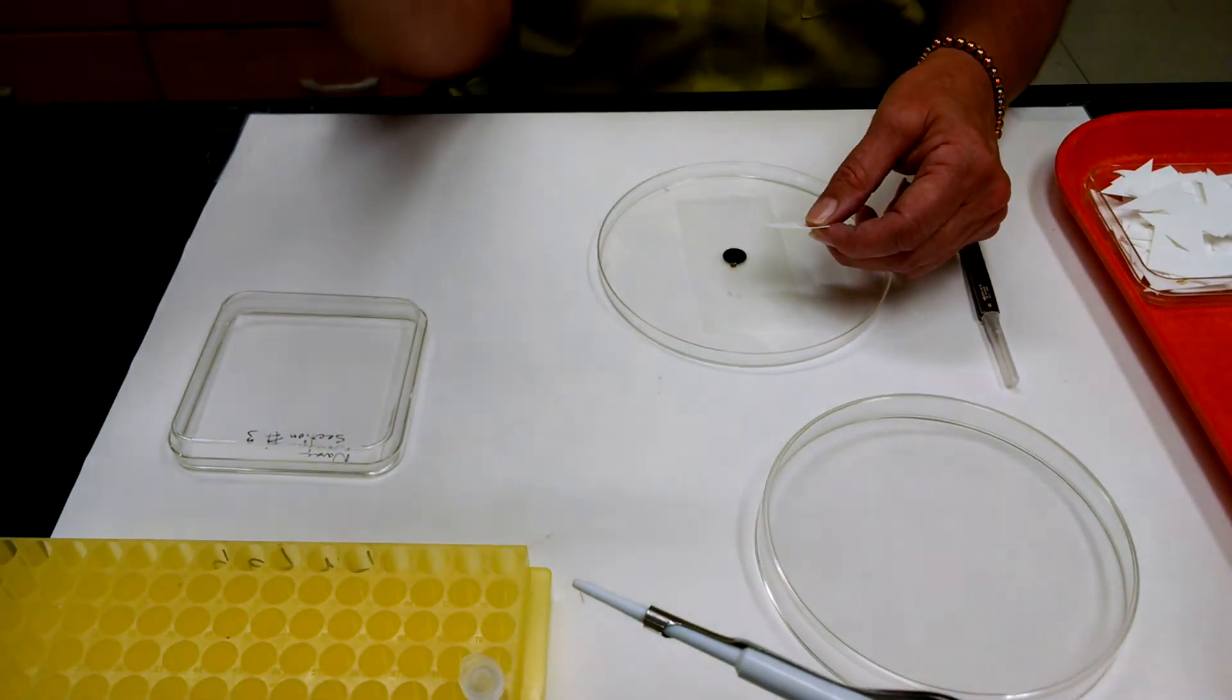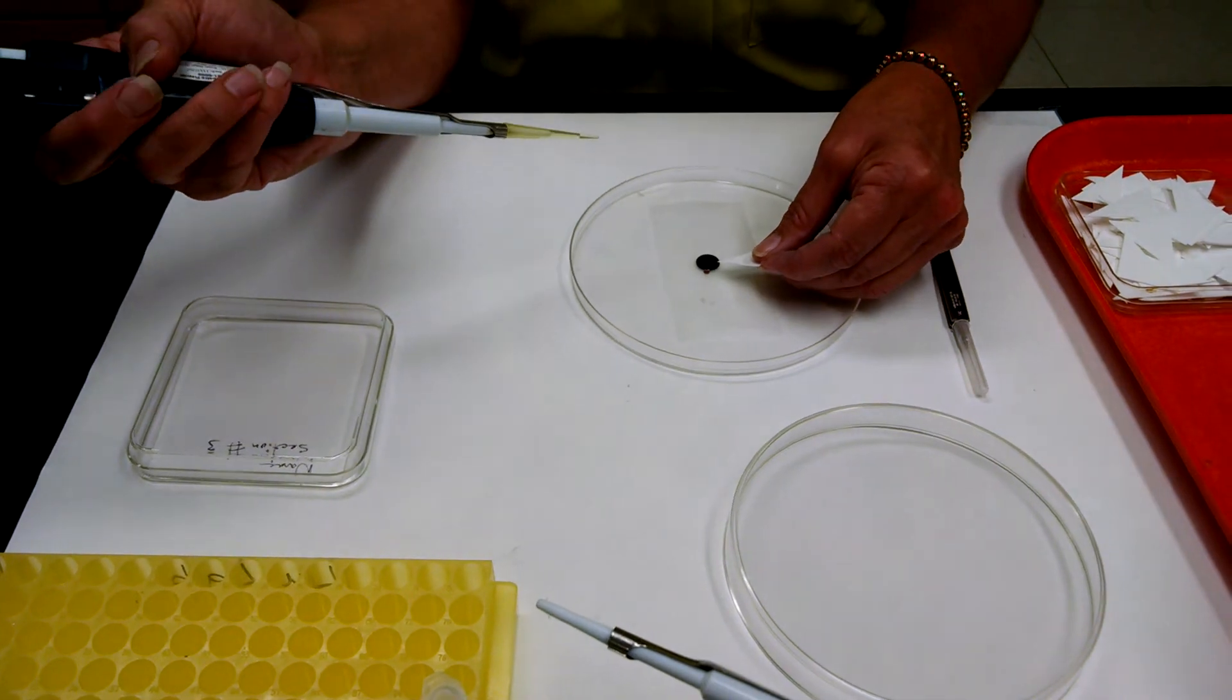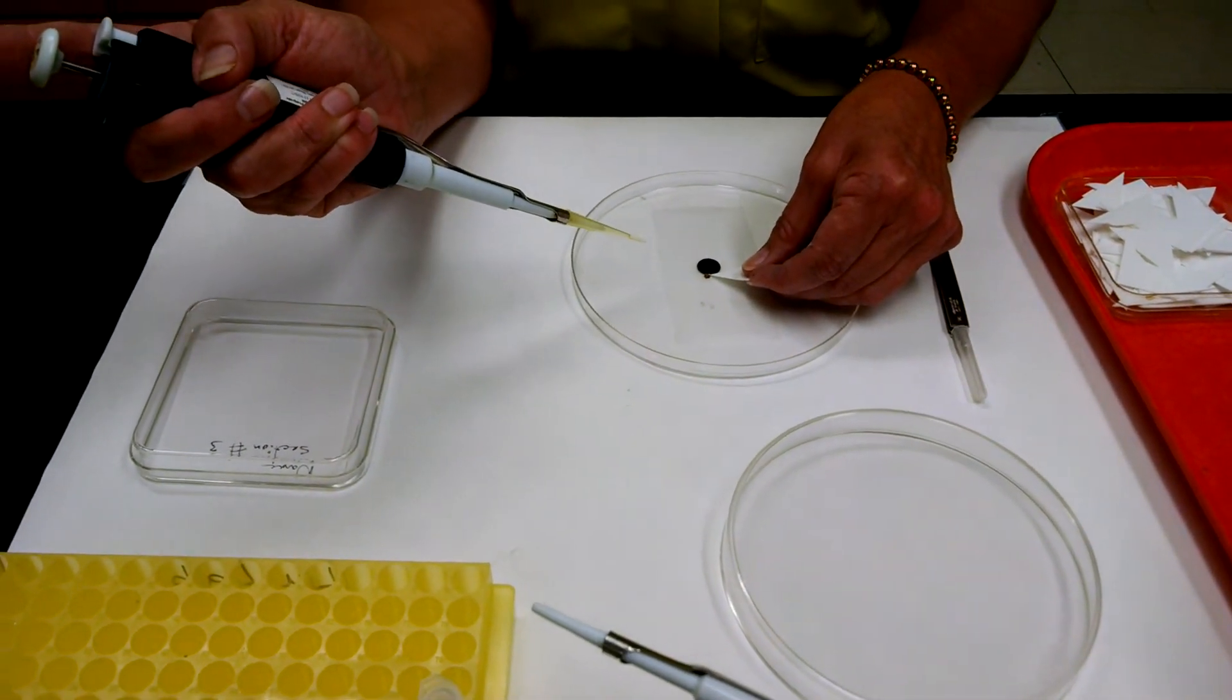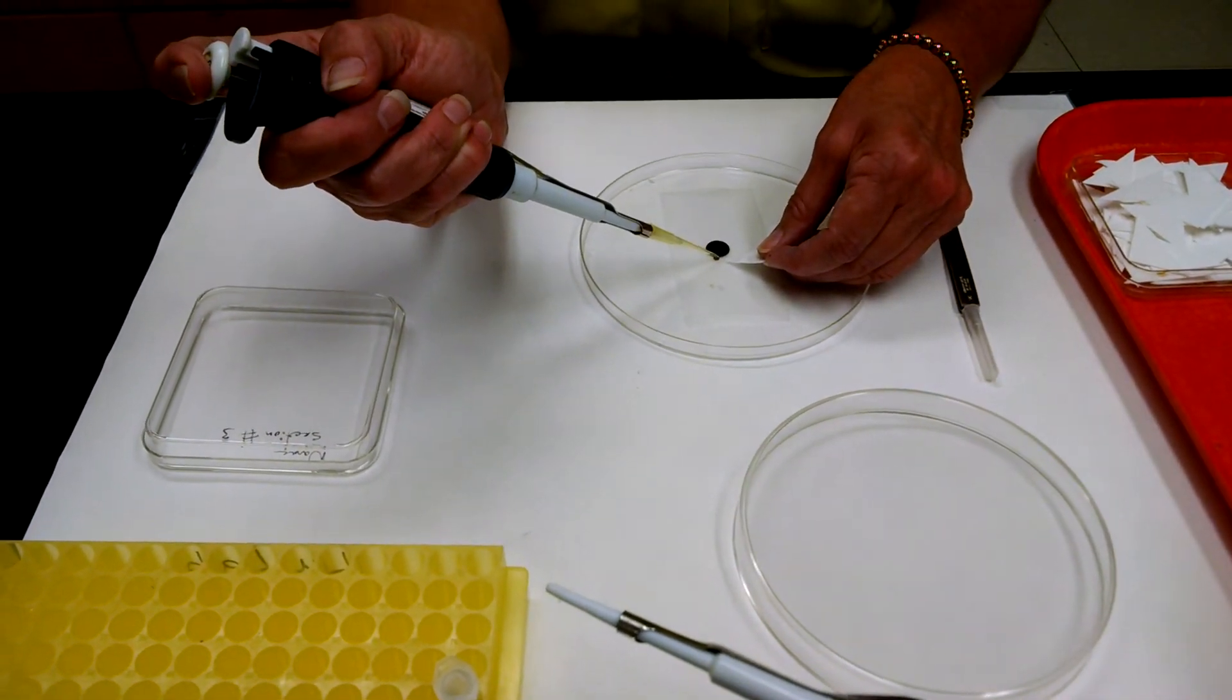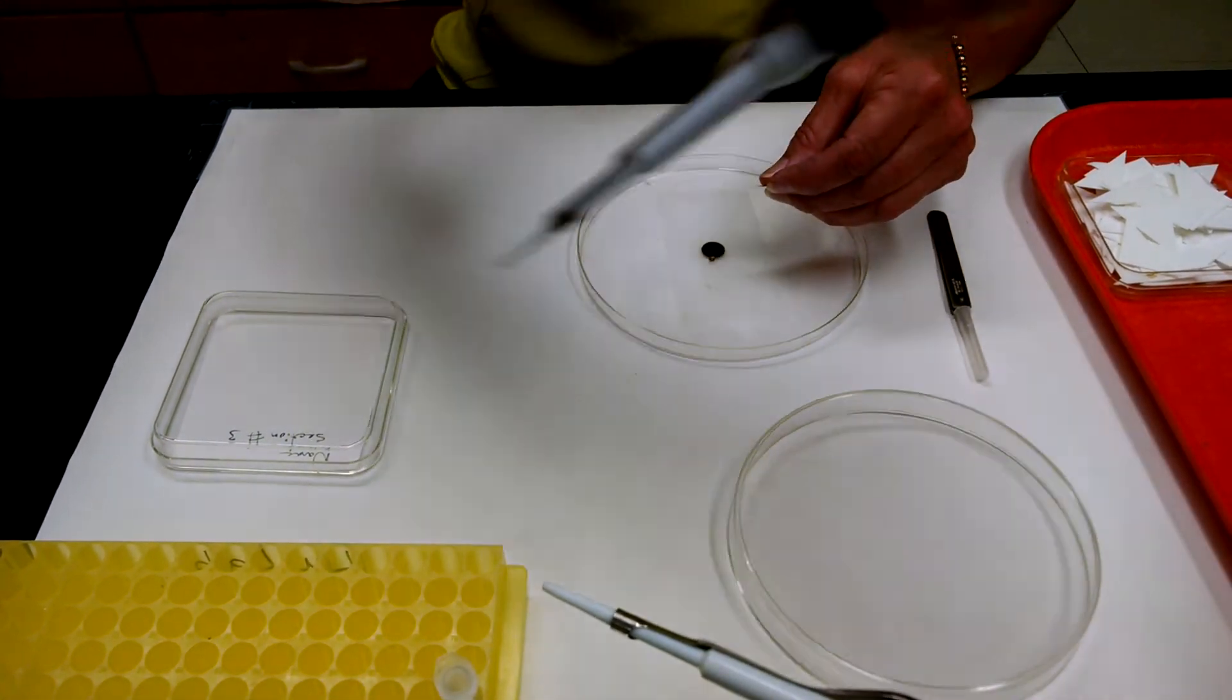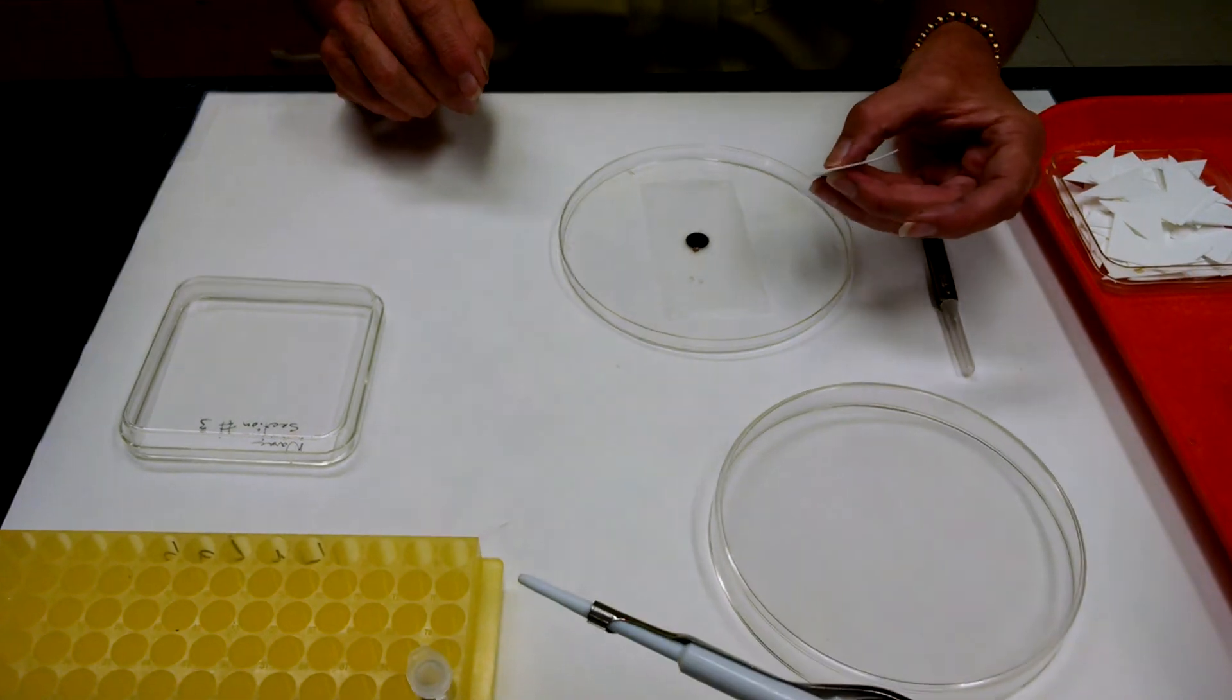I'm going to get my uranyl acetate. I'm going to spin my Whatman paper to another corner. I'm going to touch the grid, remove the wash water and put the uranyl acetate on. Dispose of the tip. We're going to let it sit for two minutes.